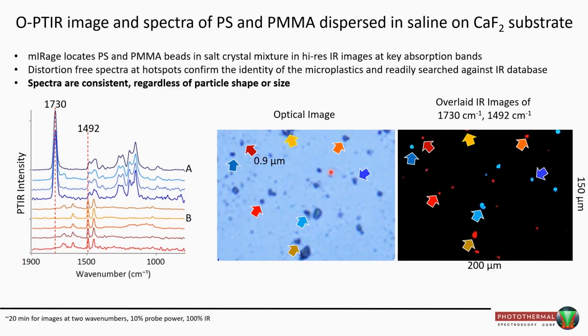And what that means is now you've got these mixtures of beads in amongst salt crystals, and measuring in salt crystals in amongst salt crystals with the infrared. It's a no-no, it just wouldn't work. But in this case, we've targeted various beads.